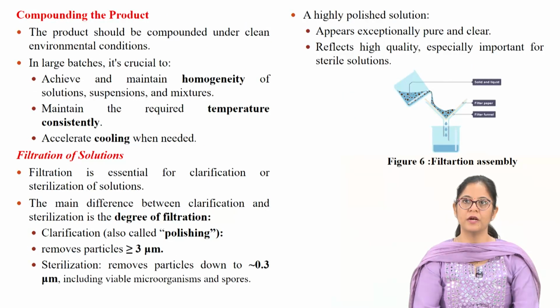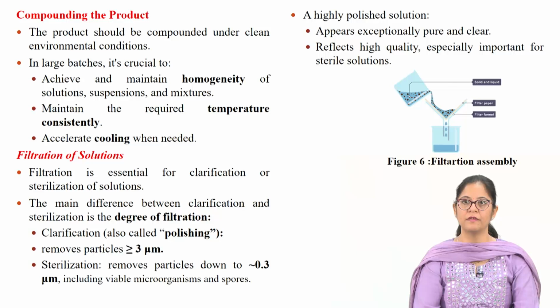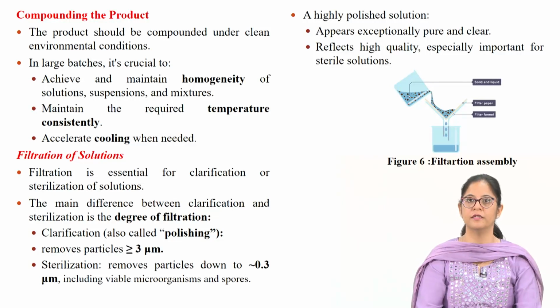The product should be compounded under clean environmental conditions. In large batches, it is crucial to achieve and maintain homogeneity of the solutions, suspensions and mixtures. Maintenance of the required temperature is important. Accelerated cooling is also required when needed.